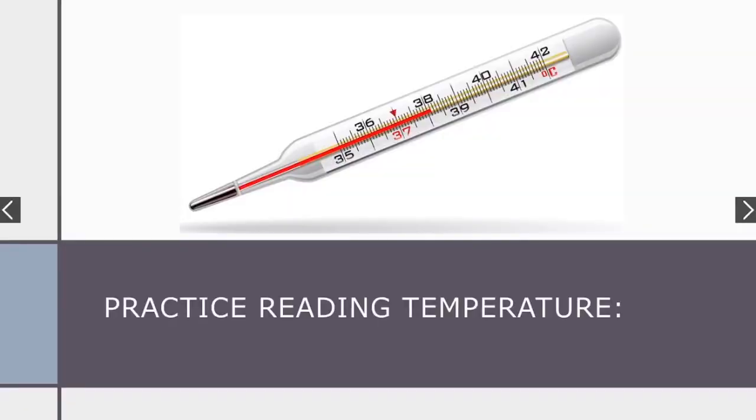So let's go ahead and practice measuring temperature. Like I said, we have mostly glass thermometers in our lab. So let's go ahead and practice measuring a glass thermometer. Pause the video and give this your best shot at measuring, and then we'll talk about it in just a minute.